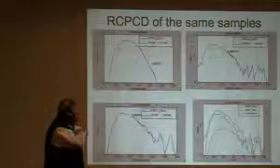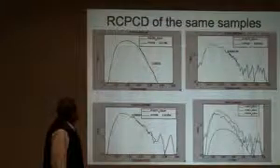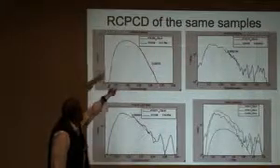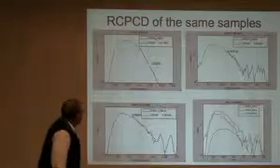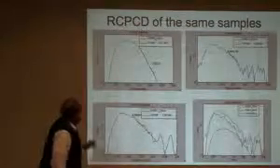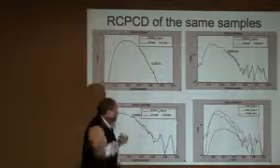And we looked at all three samples, and there are slight differences. Okay, so we go left, 1, 2, 3. This is the highest crystallinity sample. And we really don't see much difference here in the primary decay that we see here.